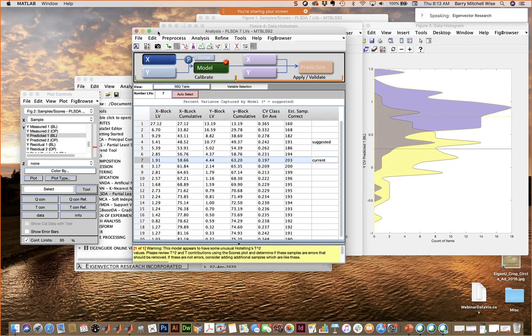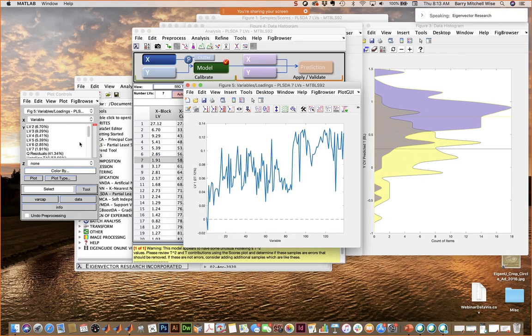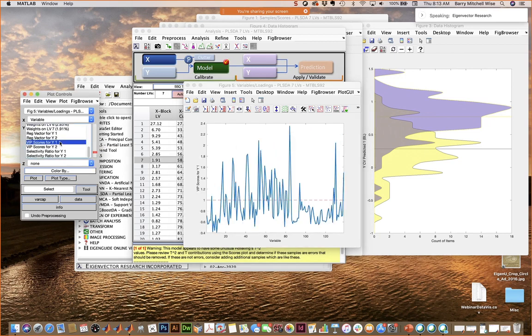The other thing I wanted to point out is if we're looking at loadings and we want to find important variables, I'm going to run down to the VIP statistics, the variable importance in prediction. These are discrete variables. Each one is the concentration of a different lipid. If you put the labels on here, this would be pretty busy. You don't really want to see all of them.